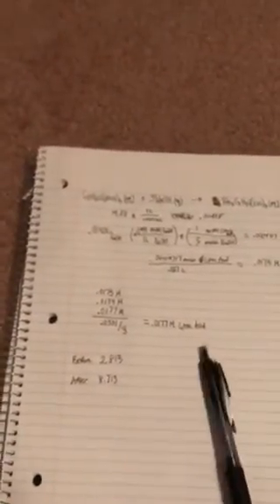When we did our titration, or our neutralization, we took our acid and added the base to it, so it went through the neutralization process. So it's giving a larger number because it's less acidic, and it's actually very close to the neutral point, which is 7, between 1 and 14, meaning that 1 would be the most acidic and 14 would be the least.